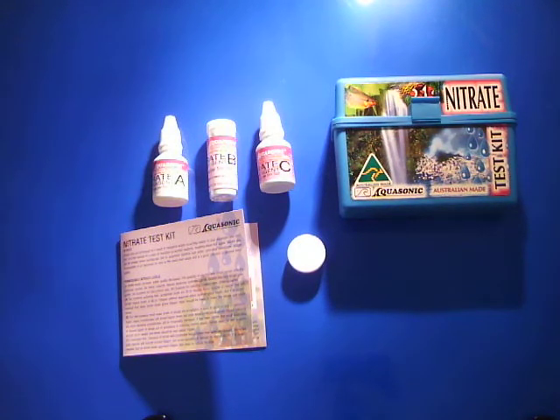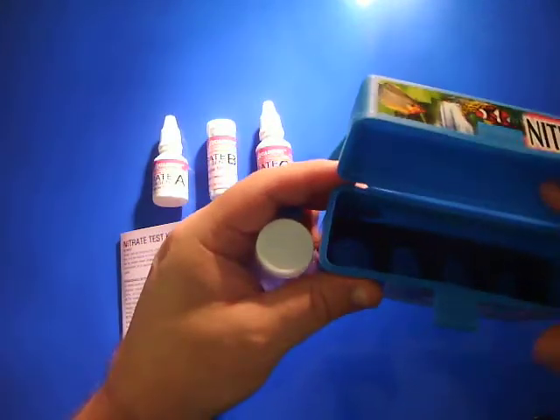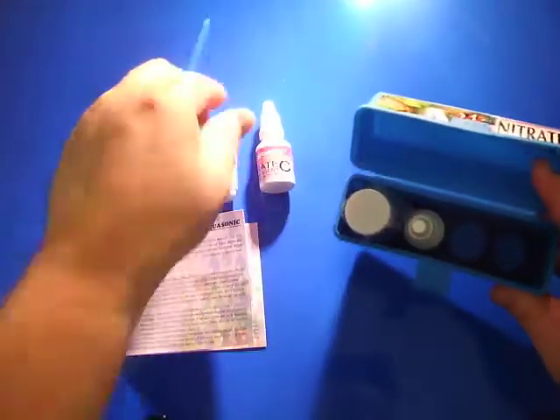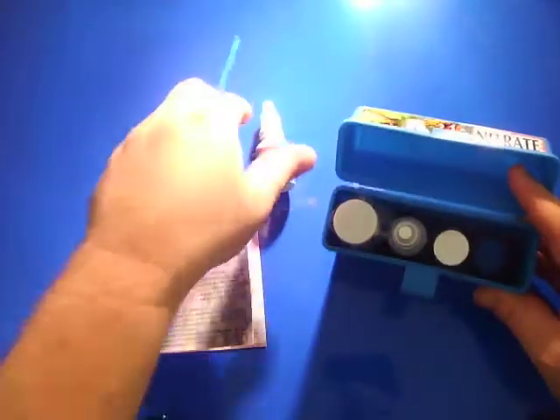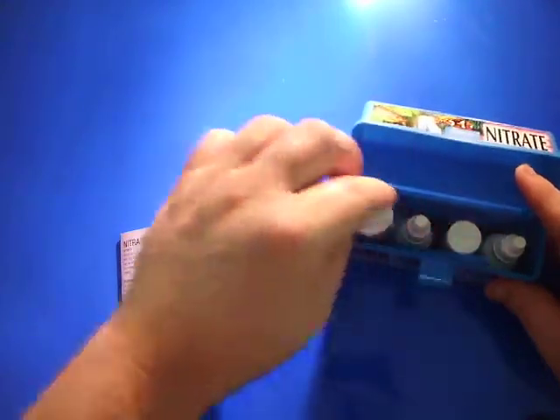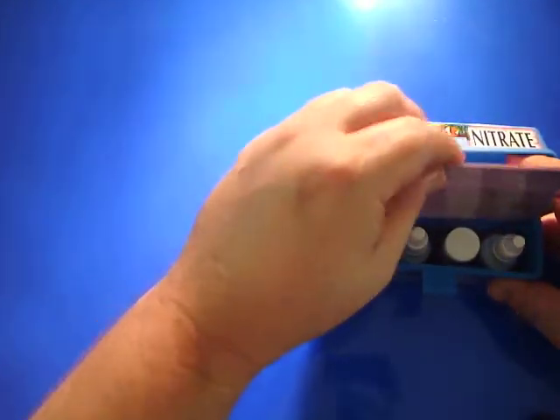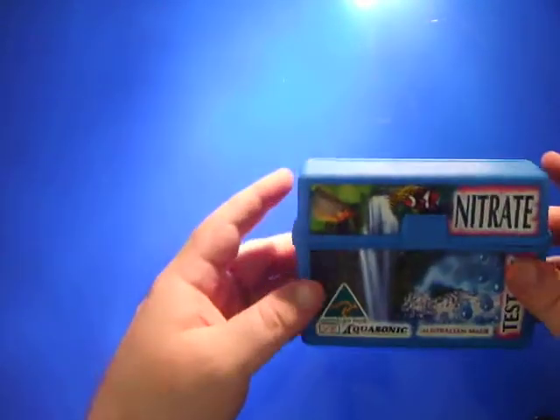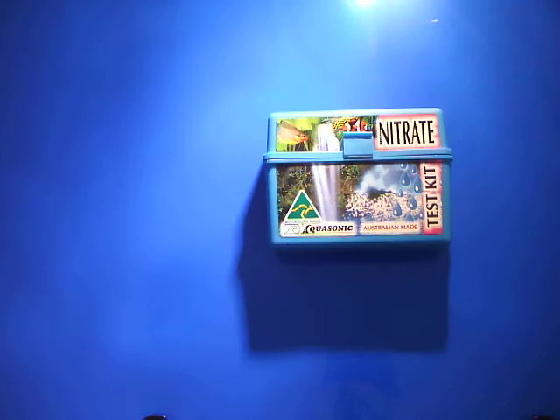That way you can have a healthy and good environment for your fish — they're not going to be as susceptible to diseases or stress. When you're done, you just pack it straight back into the little kit. It's nice and dry, nice and easy to use — a great little kit. Won't have problems with water around it, and it's Australian made by Aquasonic. Great value, give it a go, thank you.